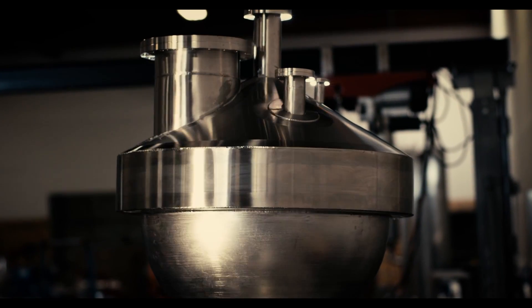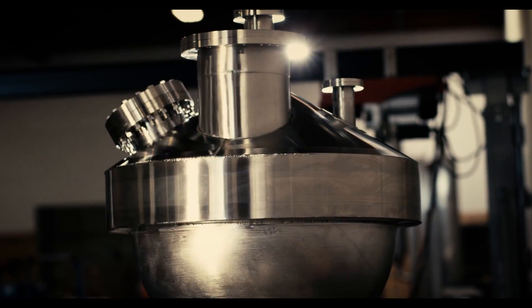It pays for itself pretty rapidly, and the flask works awesome. It does exactly what we intended it to do — safety and durability.